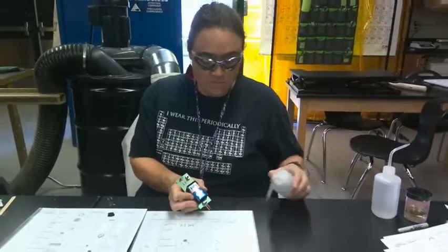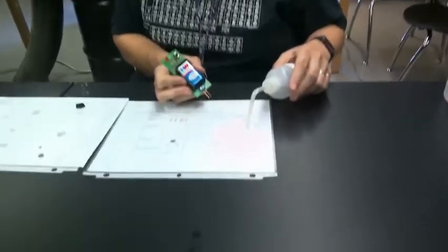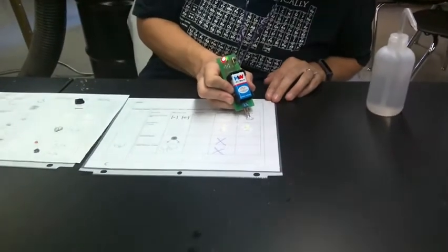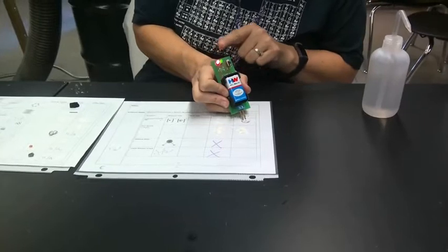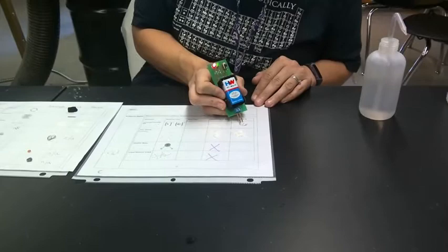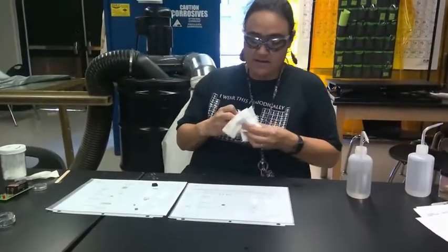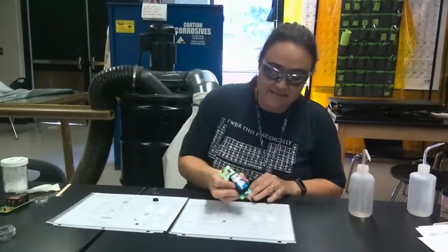Now I'm going to take some water to that solid and make a solution and retest. If I retest this, you can now see that we do have a light. And since both lights are illuminated, I would call this high conductivity. Before changing substances, I'm going to clean my conductivity meter and we will move on to the next test.